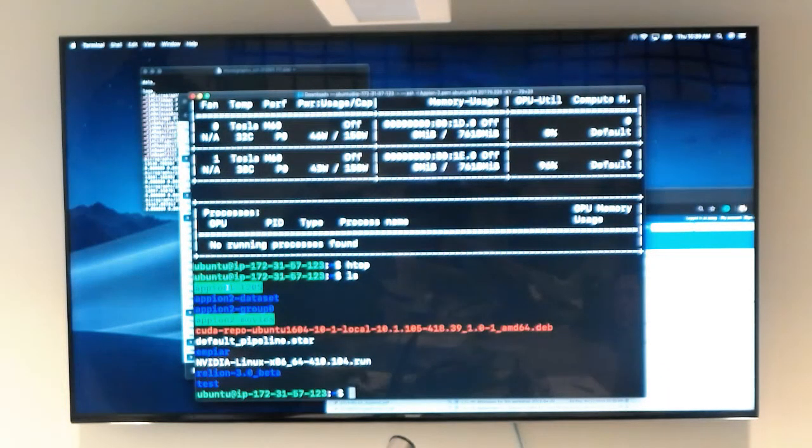We have the Appion 1 T20S dataset. That includes the 10 exposure images from Appion Part 1. We're not going to use that, but those 10 images can go sub 5 angstroms. Proteasome has D7 symmetry. These are not the best 10. These are just representative 10.